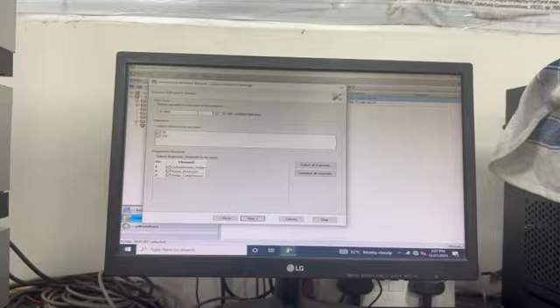We inject our sample, and maybe it will be too concentrated, so the peak will be flat at the top. We dilute it again and then see a sharp peak. Once we see a sharp peak for any component in our sample, we decide based on the last peak's appearance. Suppose we have 3 compounds, one coming at 3 minutes, one at 10 minutes, and the other at 25 minutes. So we will set the runtime at 30 minutes. This is how we decide the runtime.